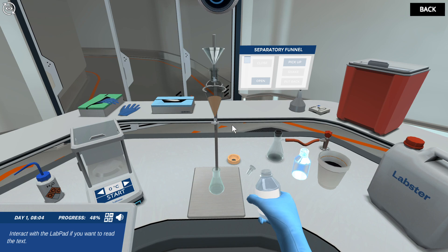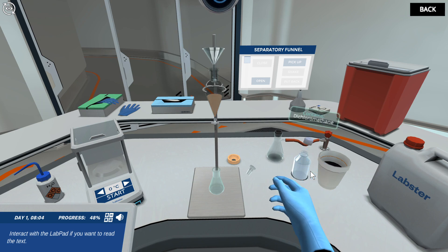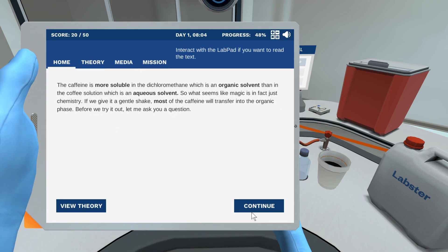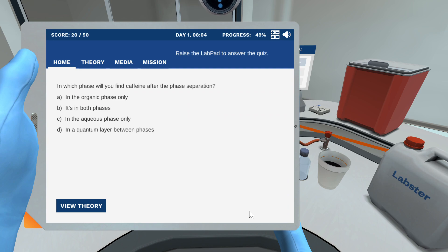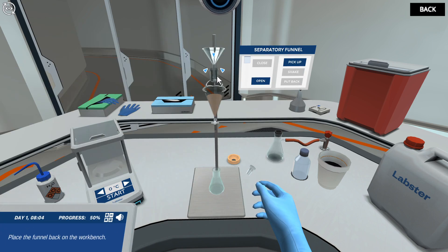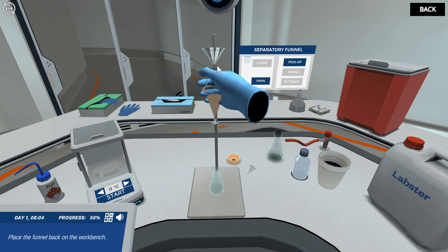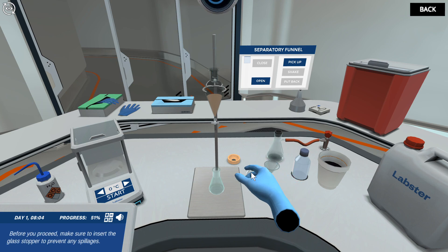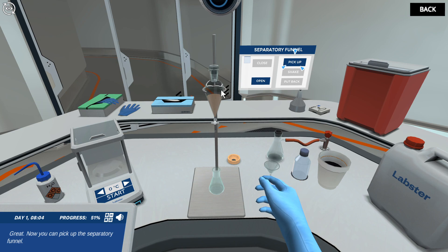The caffeine is more soluble in the dichloromethane, which is an organic solvent, than in the coffee solution, which is an aqueous solvent. In which phase will you find caffeine after the phase separation? Yes — most of the caffeine will be in the organic phase. Before you proceed, make sure to insert the glass stopper.